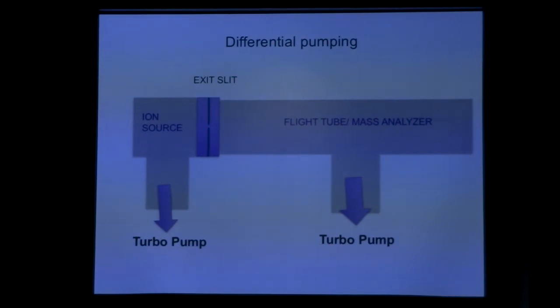It's not a new technology. It's been around a long time, but it was brought into isotope mass spectrometry in the 1980s when we began working with the continuous flow methods.